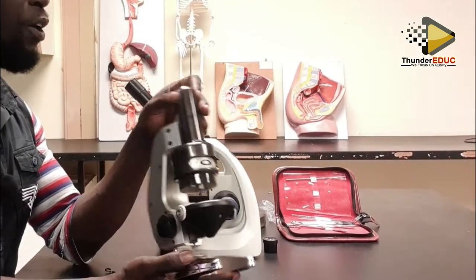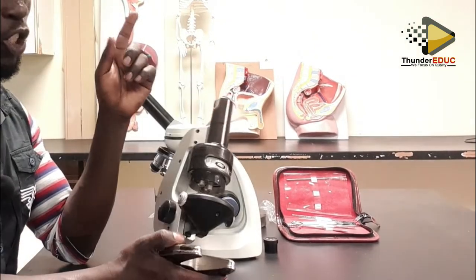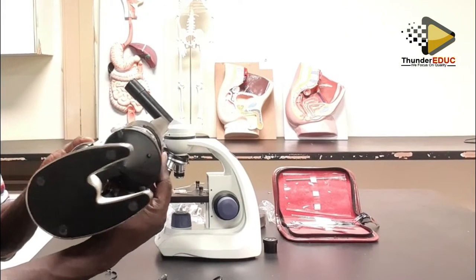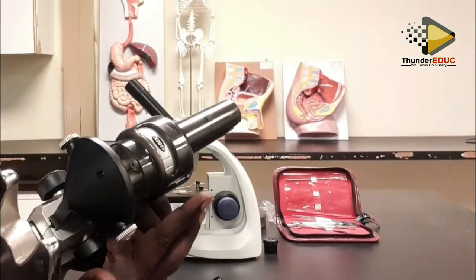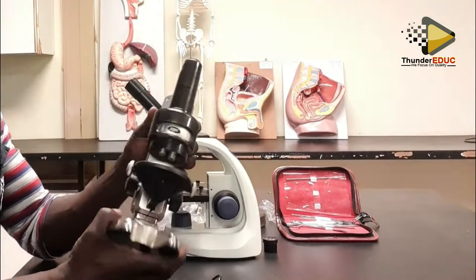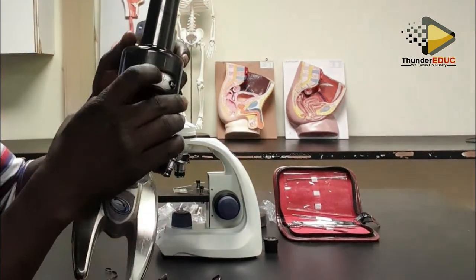But the only difference is, the eyepiece here you can't change. The objectives you can change. They are there. I don't know whether you can see them. You can see the long one, the short one, the medium, and then the short one. They are there. But how do I change these objectives? I change the objectives by turning here.